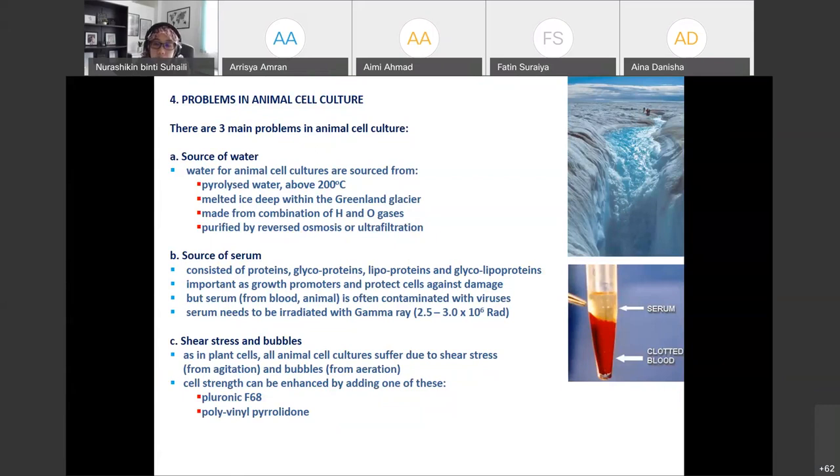for example, if we prepare... I'm sorry if I give a lot of examples for microorganisms rather than animal or plant cells because I'm not really familiar exactly with how it works for the animal cell and plant cell cultures. But for the microbial fermentation, if let's say you prepare the media, you have certain formulation, glucose, right? Nitrogen, and you dissolve all the things in a solution. Okay, that solution should be water.